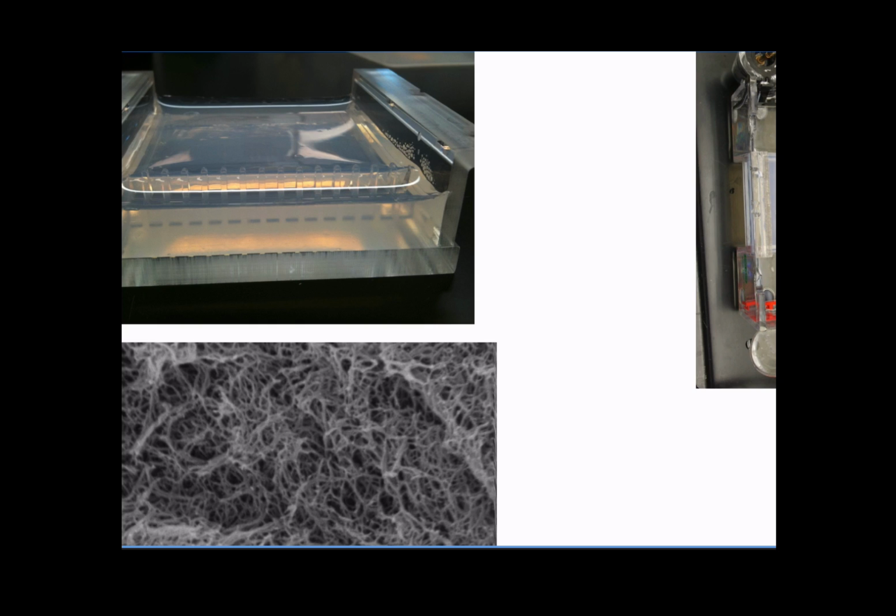used in this case. We call this a gel bed, and it's just a plastic space that will contain the gel in a rectangular form. And on a microscopic view, what we would see is that all those agarose molecules created these intermolecular links between them, giving rise to pores that are of different size depending on how much agarose you had in your gel. So the higher the concentration of agarose, the smaller the pores are going to be.